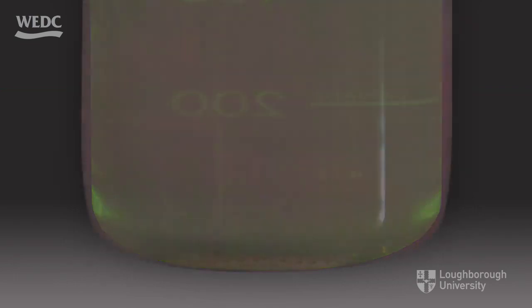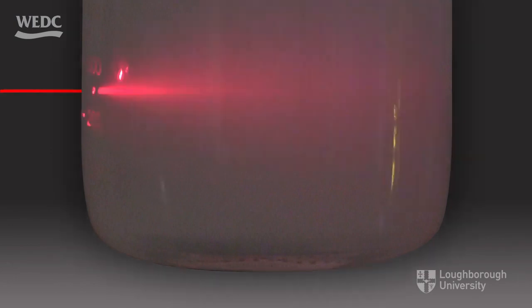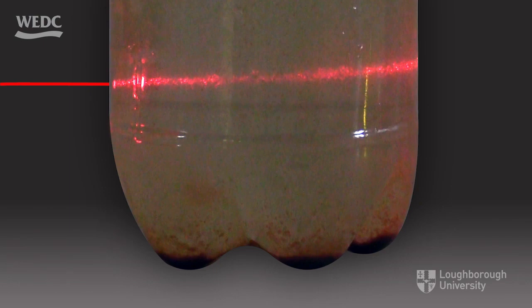If we look at milk in water, this is not a solution, it's a suspension. There are tiny globules of fat suspended in the water, so as we shine a light through it, we notice the light is scattered, confirming that it's a suspension and not a solution. Here we have iron in water. It looks coloured, and again, as we shine light through it, the light scatters.